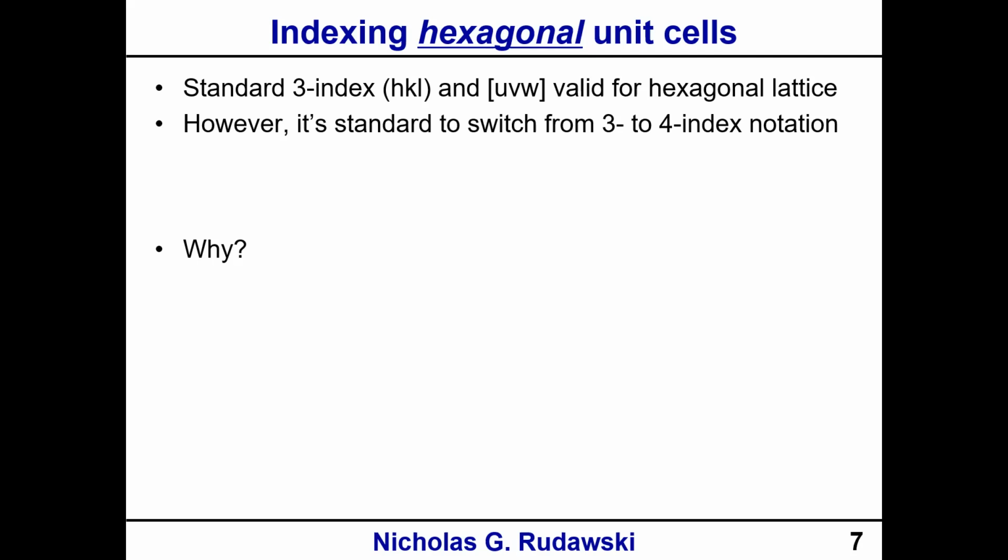...to be classified as a hexagonal crystal. It's actually classified as a trigonal crystal. So I try to make the distinction between a hexagonal unit cell or lattice and a hexagonal crystal where appropriate. HCP and wurtzite are both hexagonal crystals. So that's an important thing to delineate.